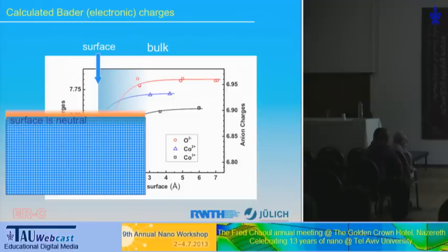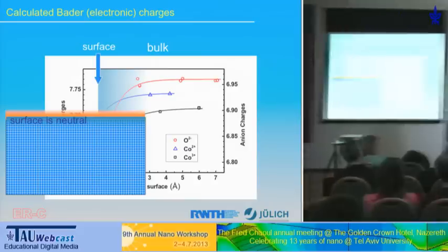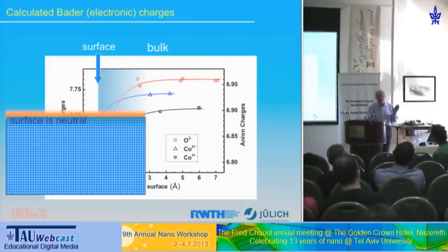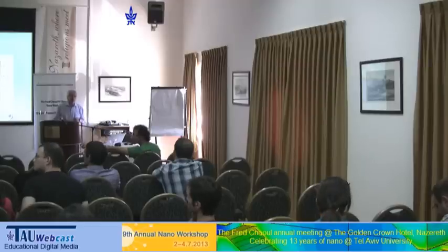Could you, in this resolution, check also charge transfer complexes at all? I think people are trying this and have tried it, but you have to do this with the DFT calculations, because by the optical means, phase shifts, amplitudes, and so on, we cannot go close enough to this.